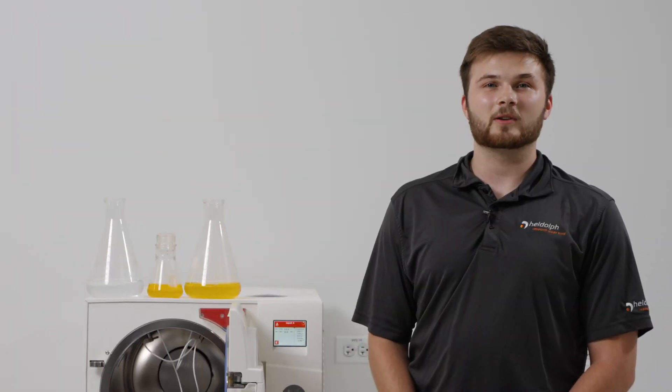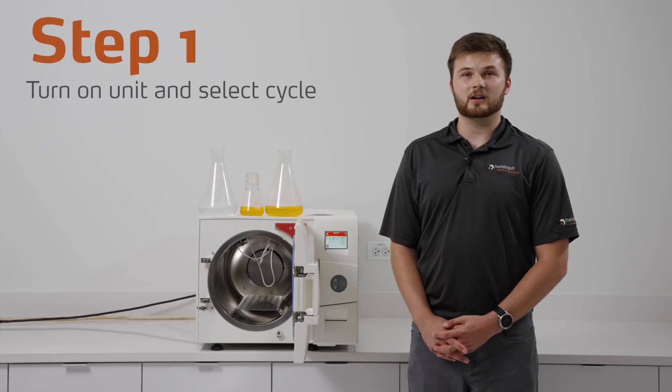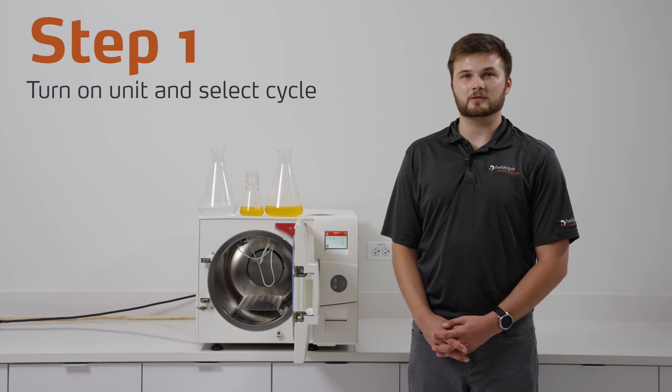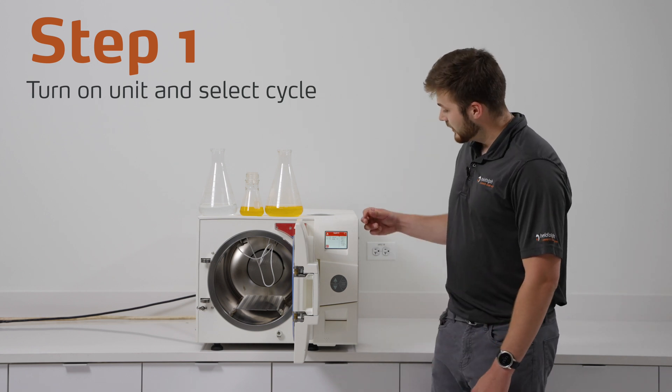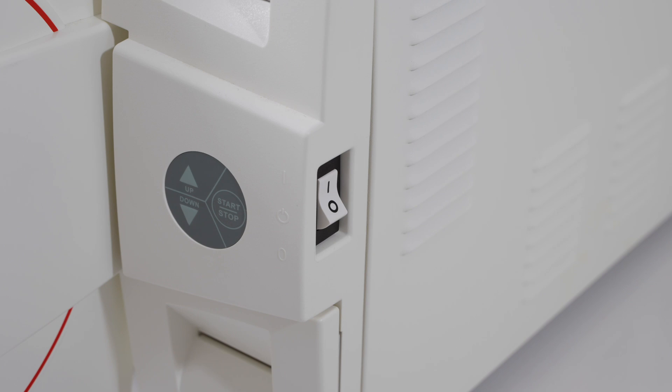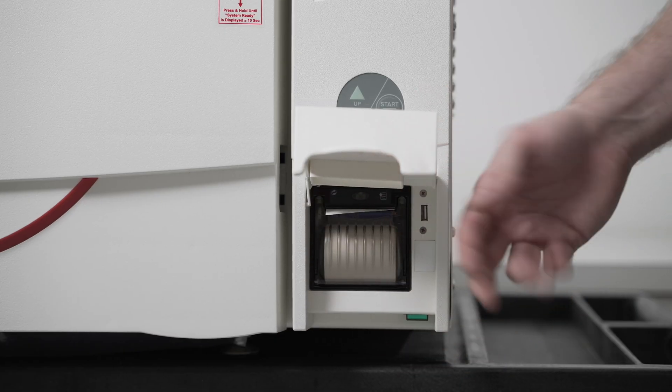Now let's go over the process for sterilizing liquids. The first step is to turn on your unit and select the appropriate cycle. On 2840 models, the power switch can be found on the right-hand side of the unit. On all other LabLine models, the power switch is located under the printer.